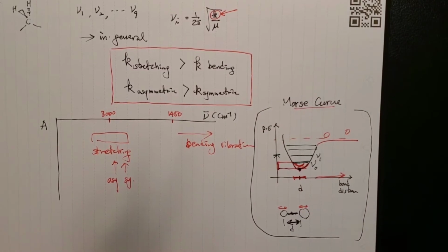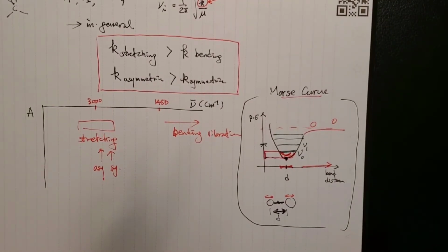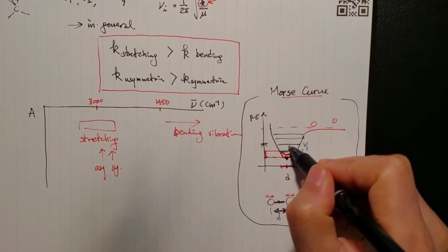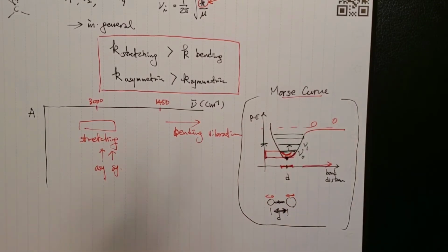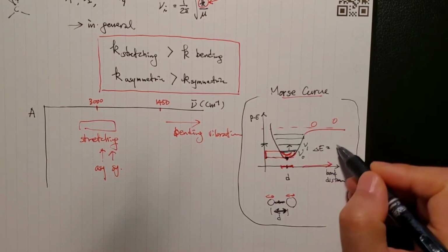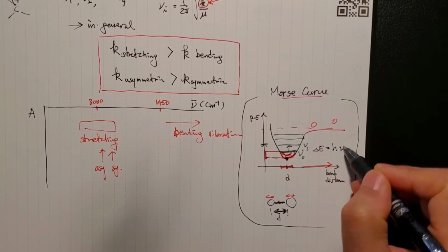The reason for me to introduce this here before we actually look at the spectrum is because you sometimes see V0 go to V1. That's what we see on the chart. That's what I'm going to teach you as the norm, the general typical feature. So that's the delta E that we are talking about right here.